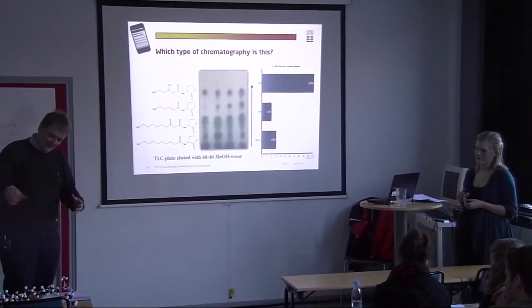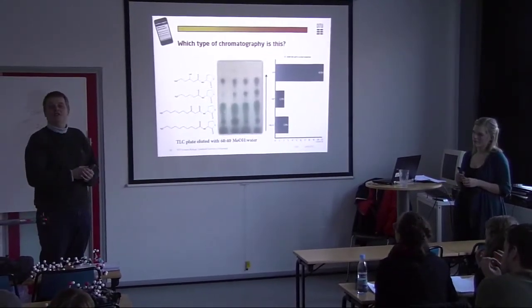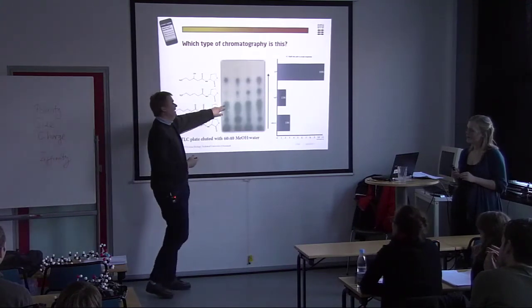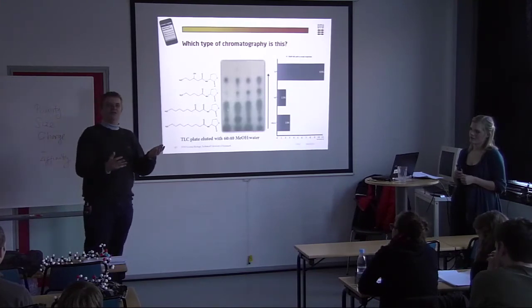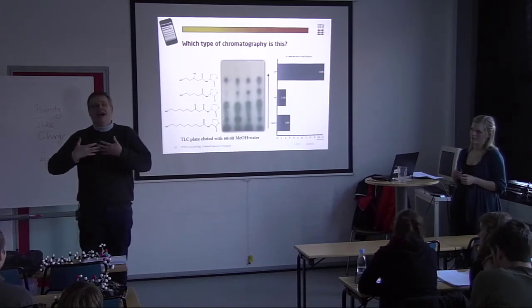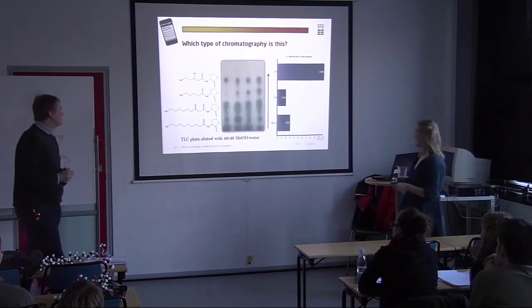And then you put it in, you shake it very fast, and you pour it over the TLC plate, and you wait for about three, four days, and then you can simply see it gets colored where you have the signaling molecules. This is also an example of where we interface chromatography with biology and use biology as a detector.